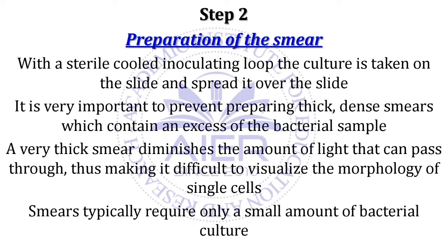Sometimes a mixed culture may be present, so within the same culture we can have gram positive as well as gram negative bacteria. If we pick a very small sample, within that small sample these kinds of microscopic entities are very easily identified. So we never need to draw a very big, spread out or thick smear. We don't need it.